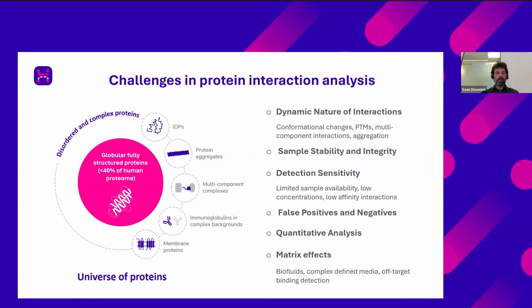It's nice to start at the beginning, and where we started when we first were thinking about developing this technology is really where are the challenges in protein interaction analysis. For anybody who's worked with proteins, many of the features on the slide will be very familiar. Proteins are very complex molecules to work with. Some of them are easy and many of them are very difficult. They are highly diverse and frequently heterogeneous.